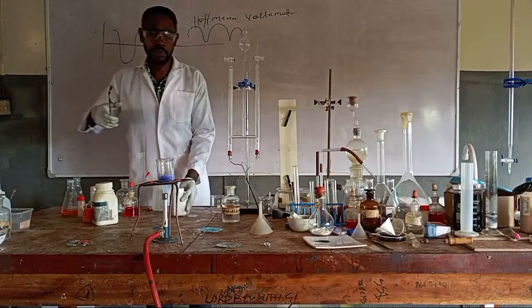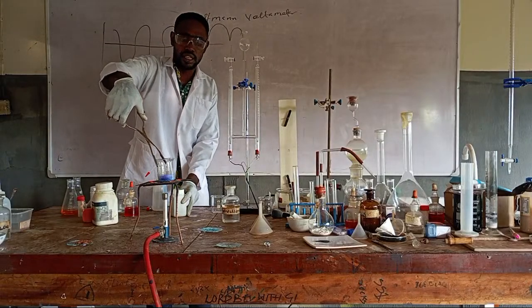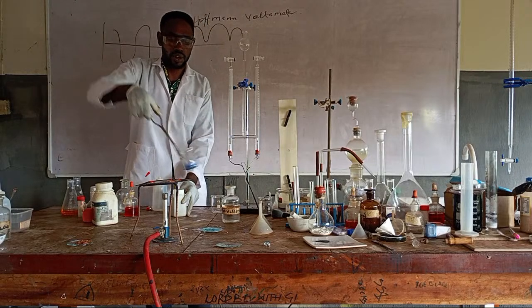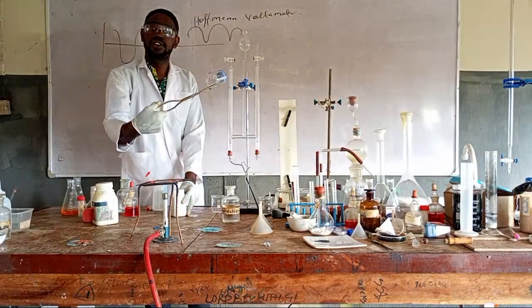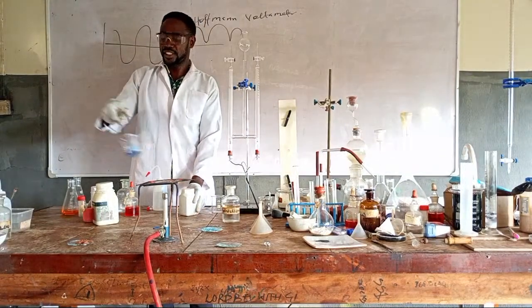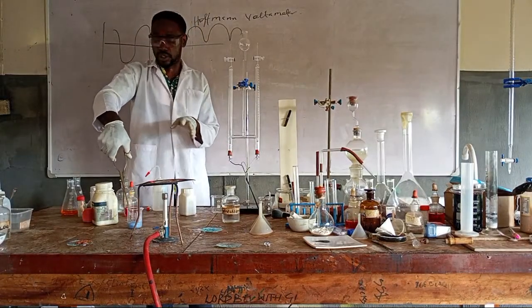Believe me, I've not opened it since that morning. I think the thing is dry, right? Yes. Now, for those that didn't see the color well, I hope we can see well. Even now, you can see, don't worry. This is the solid. If I add water to it, it comes back to what?